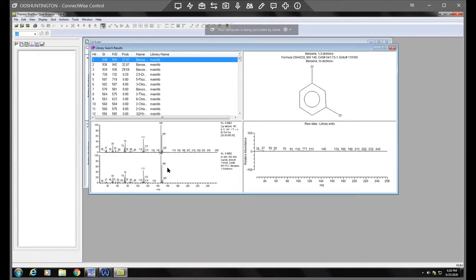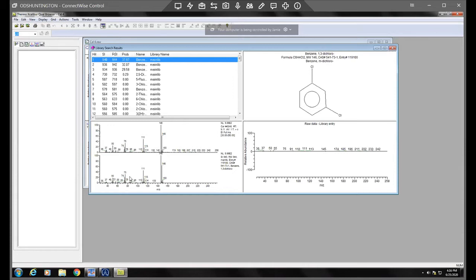You can see the largest mass that came off was the 146. So that matches pretty well, as well as the 148, the 111, 75, 50, and so on. So it's using algorithms and things to determine how close of a match this is.